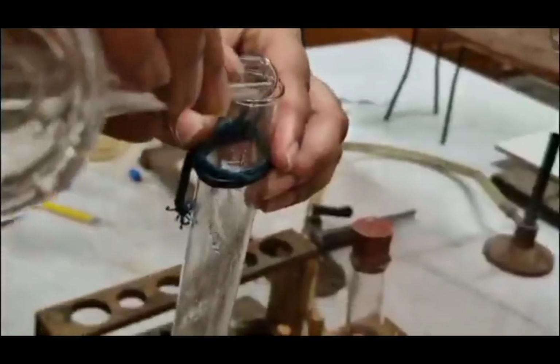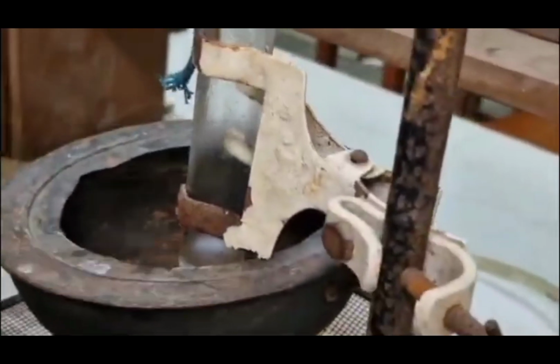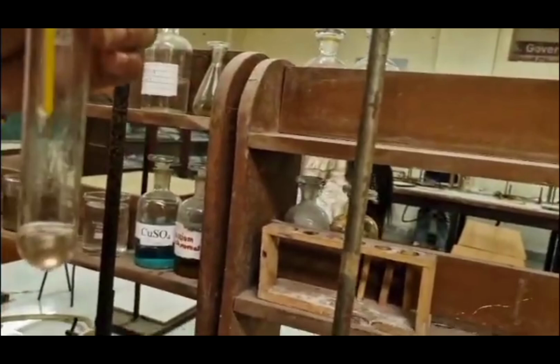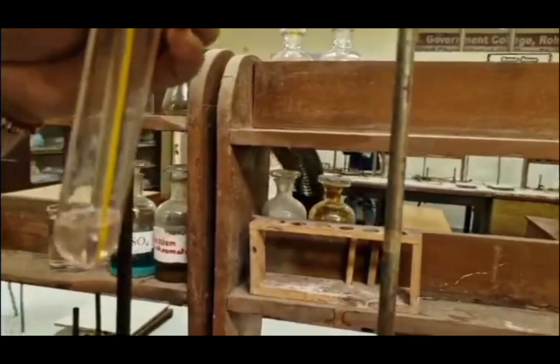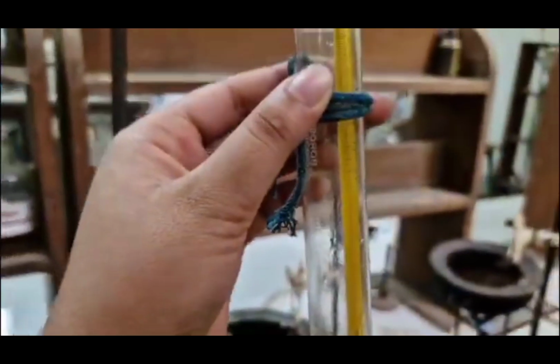And again add 2 ml water in the NaCl water system and note down the temperature when turbidity disappears. In our phenol water system, we can see that the turbidity has disappeared. We will note down that temperature. And in NaCl also the turbidity has disappeared. So note down that temperature also.